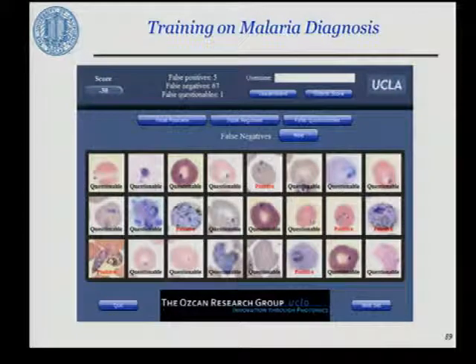Now you can actually go to biogames.ee.ucla. We're not trying to learn anything from the crowd anymore. After millions of diagnoses, we know very well what every single image in our library is in terms of being positive, being negative, being questionable. Questionable means that image in itself cannot be used for diagnosis. It's something that's also very important.